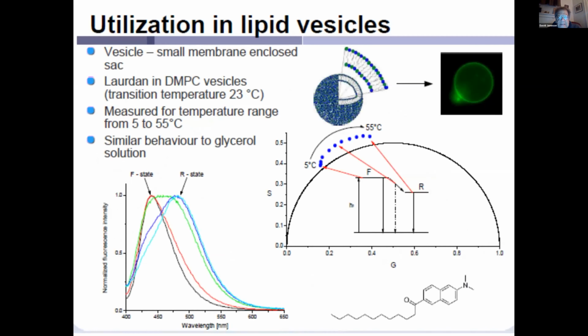Here we see it in lipid vesicles, and you'll hear a lot more about membranes and phasors from Lionel and others. And you can see, if we're looking at temperatures where we have Laurdan in this case, the phasor is outside the universal circle because we're having relaxation, I talked about that dipolar relaxation around the excited Laurdan.